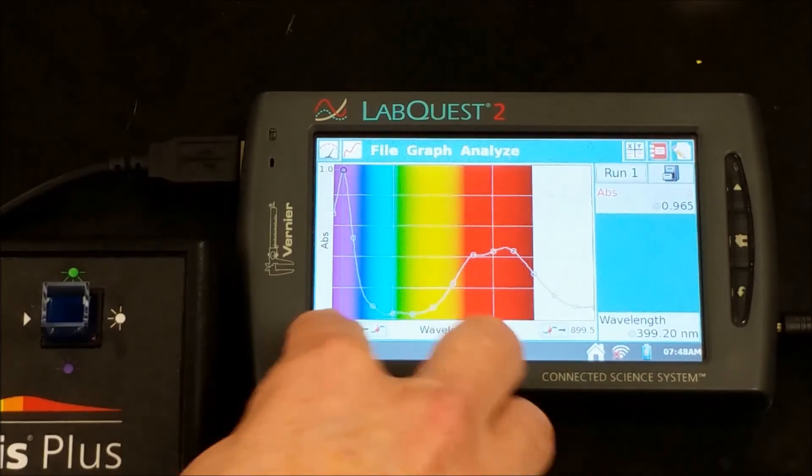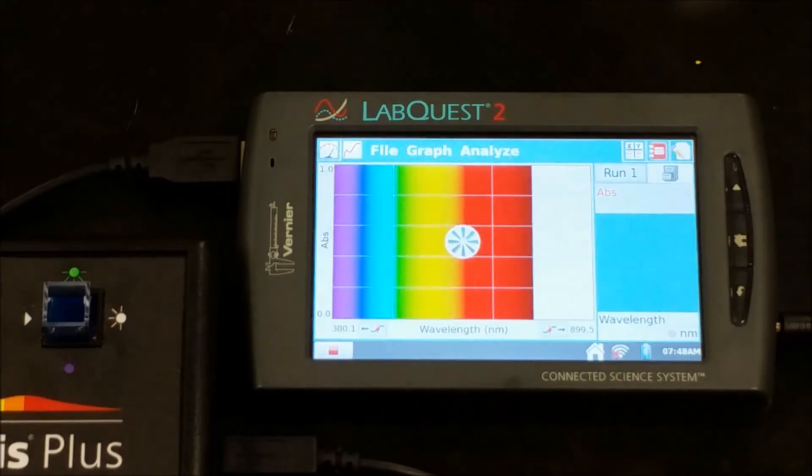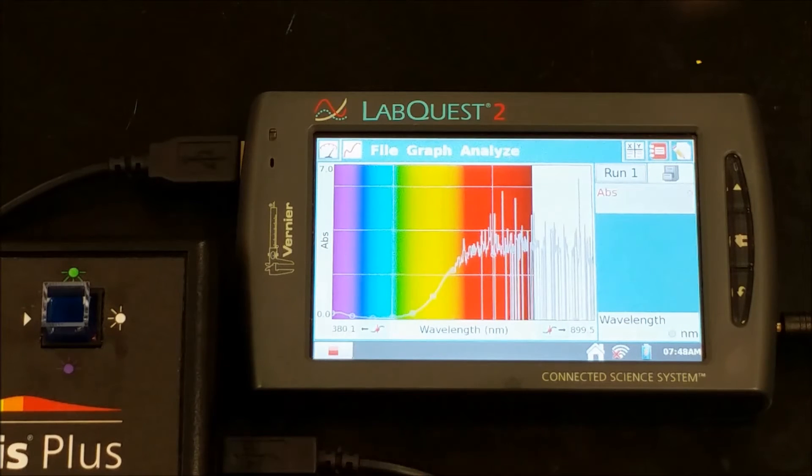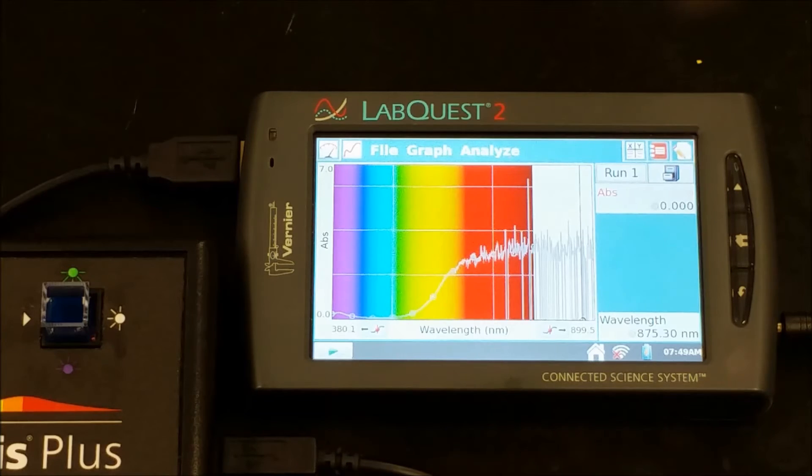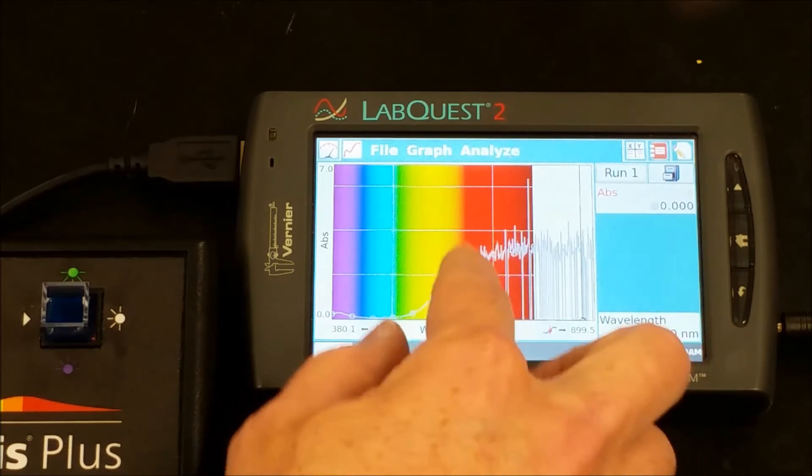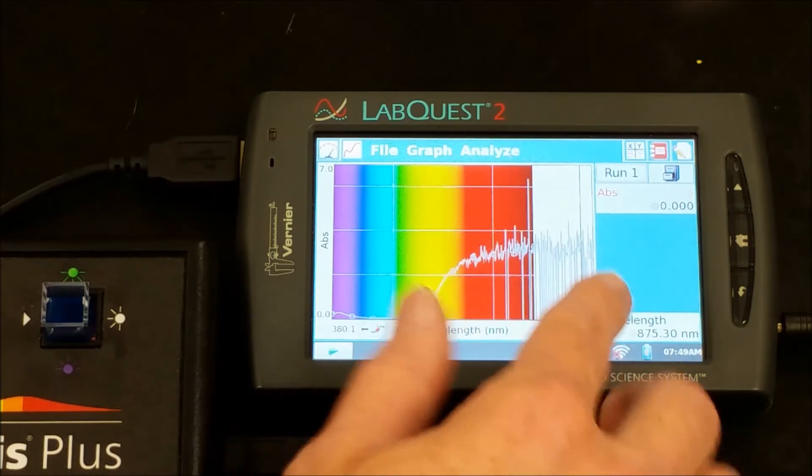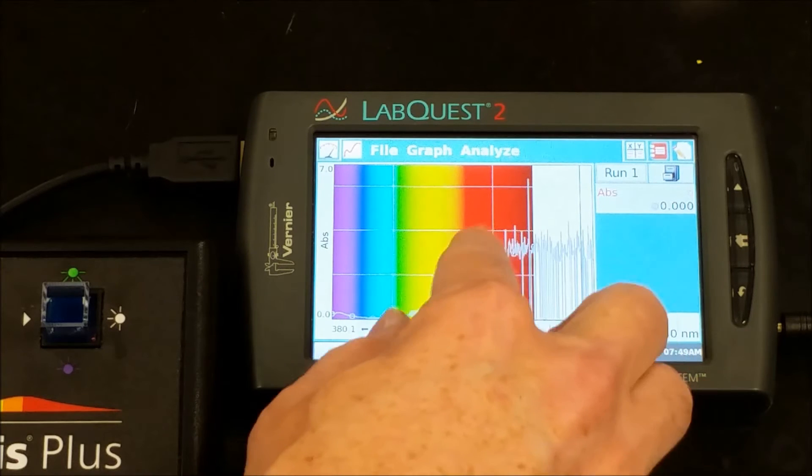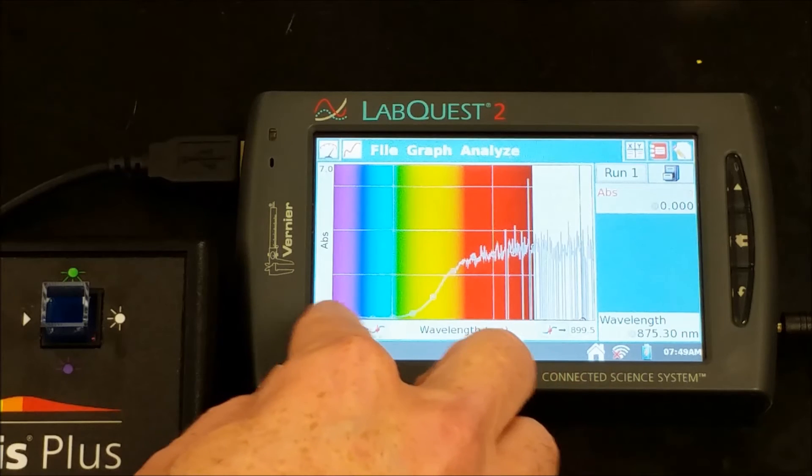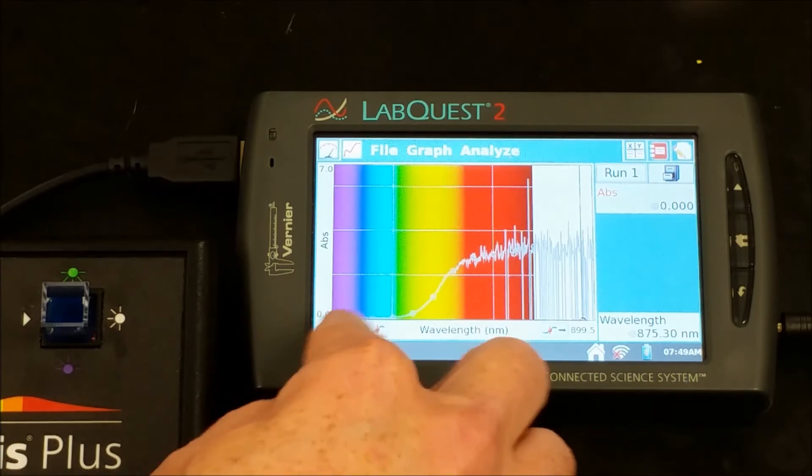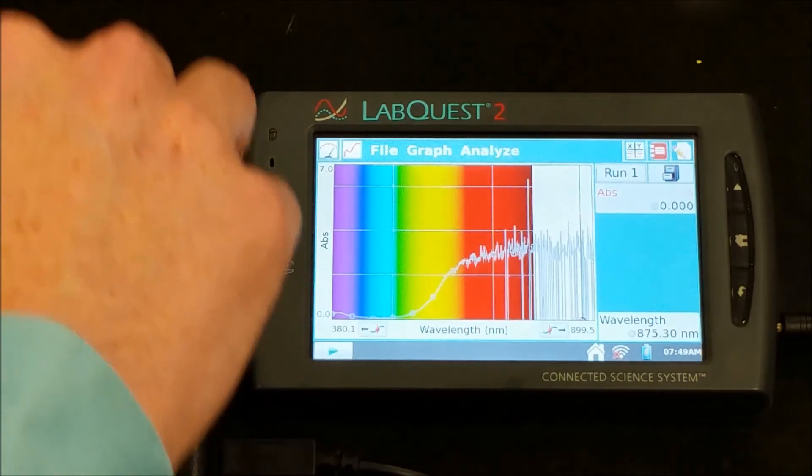For blue, we're seeing a lot of absorption in the red. Looks like it's getting a little fuzzy there, but we're getting a lot of red absorption, a little bit of orange, a little bit of yellow, and then our blue is being transmitted. A little bit of purple being absorbed, but mostly being transmitted, and a lot of green being transmitted.